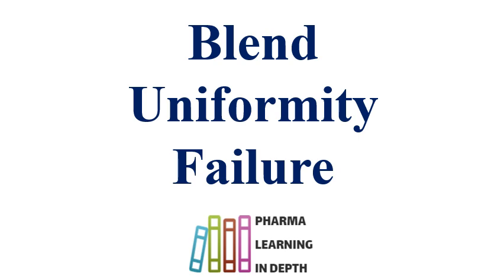As per my experience, if you find variation in the blend uniformity samples, then you should go for compact sampling for BU sampling rather than powder sampling. Also, always try to sample the 3x to 5x sample size so that you will have a good amount of blend or powder quantity to minimize the variation and improve the analysis.